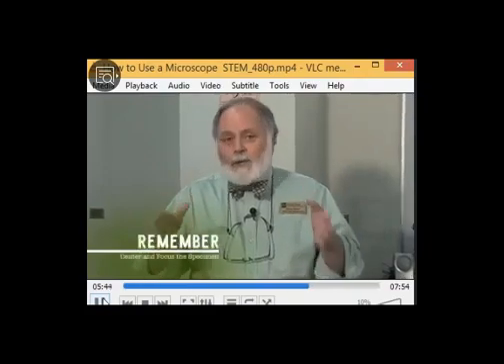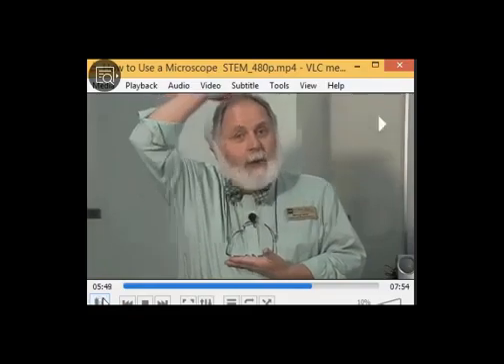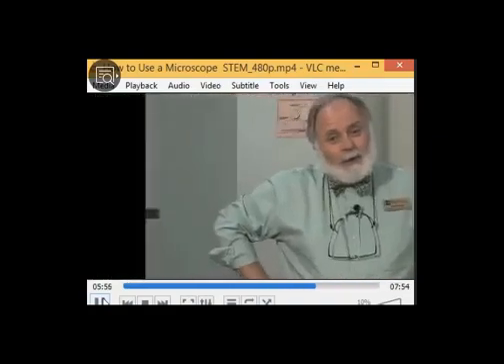Okay. Now see, he is showing you the field of view. In a smaller magnification, you can see the complete picture of this person. But if you increase the magnification power, now you can see only a part of his body. You cannot see the complete picture. This is called field of view. So when you increase magnification power, field of view decreases. I think you understand this.